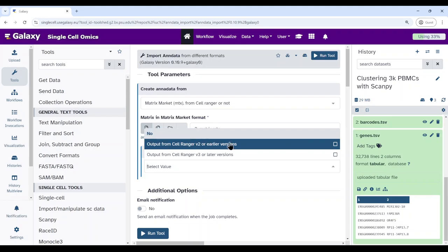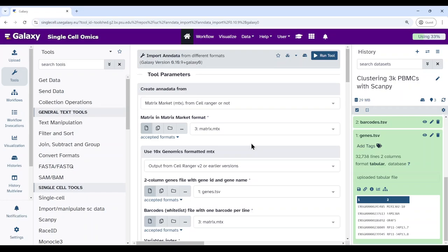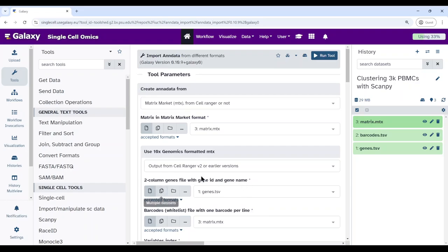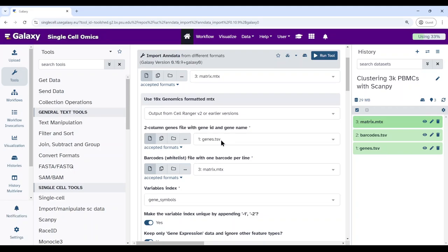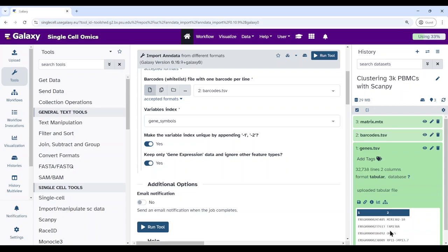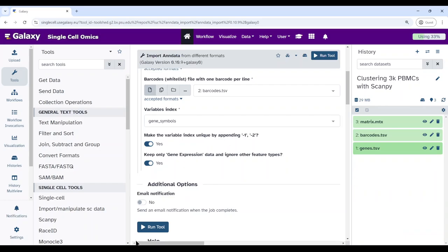Cell Ranger is a proprietary pipeline from 10x Genomics. Usually you get these three files — genes, barcodes, and matrix — directly along with the sequencing data, analyzed with Cell Ranger. Select genes.tsv, and then barcodes — make sure you don't have matrix here, but barcodes, otherwise you'll get an error. We want to use gene symbols as our index, meaning the second column, not the first, because Ensembl gene IDs are hard to read while gene symbols are easy to understand. Then run the tool.